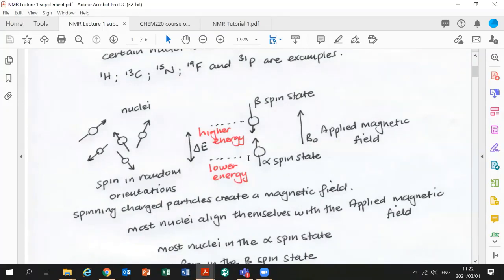And then we have to spin in the direction everyone's spinning with. So imagine now that there's a march, and everybody is marching in one direction, and everybody's spinning in one direction in that march, and you are placed in that march. You're going to want to spin in the same direction as everybody else and move in the same direction as well. If you want to go the other direction, you're going to have to get some energy now to fight off why everyone's spinning in one direction and to spin in the other direction and go the other way, right?